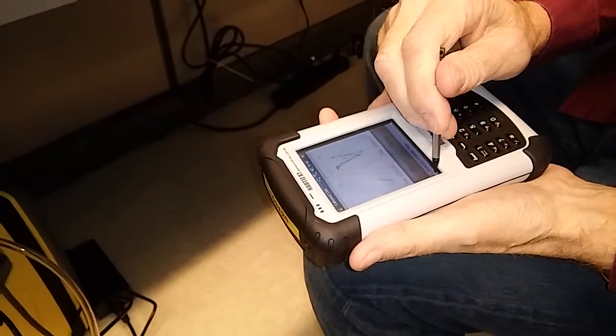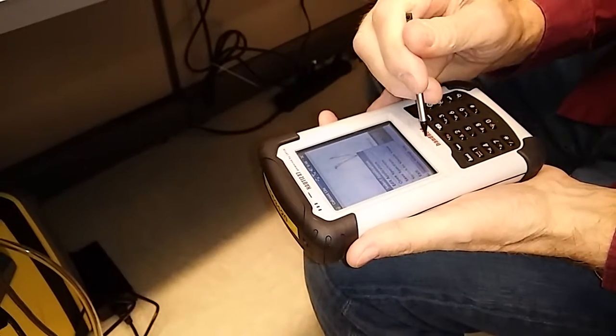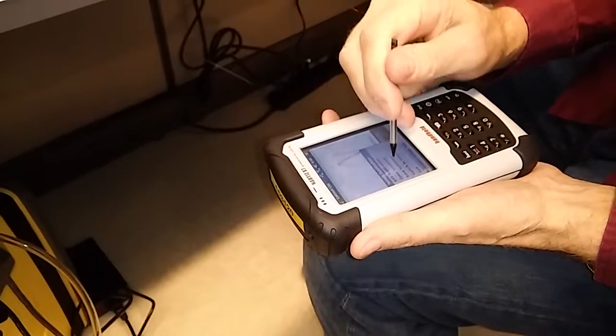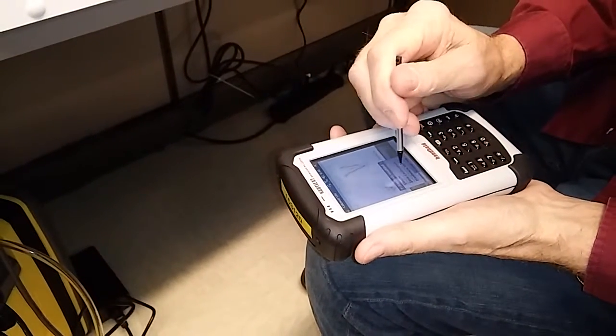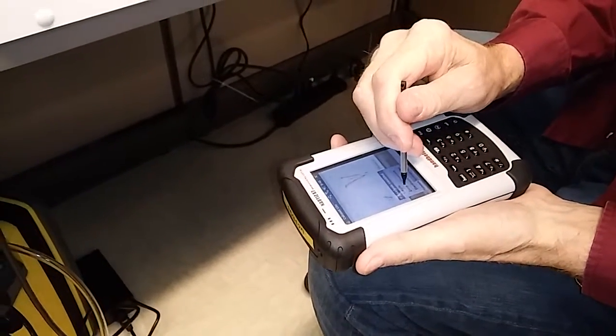And now what we're going to do is go to File, and we're going to basically go back. We're going to measure, take a single measurement.